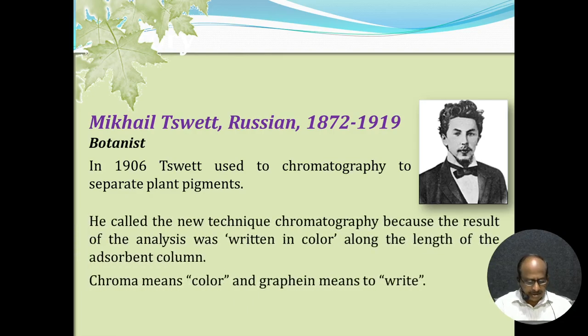He called the new technique chromatography because the result of the analysis, after completion of the technique, was written in color along the length of the adsorbent column. Chroma means color, graphy means writing. Whatever pigments are present, each color is written out like that. That's why it is called chromatography.